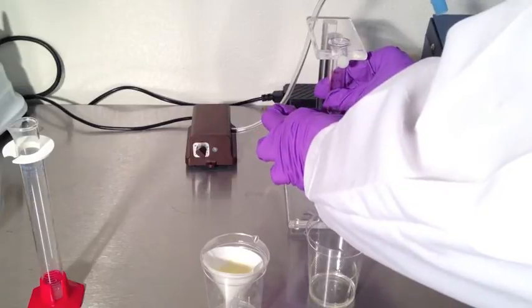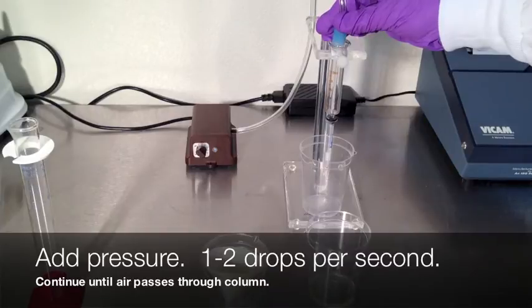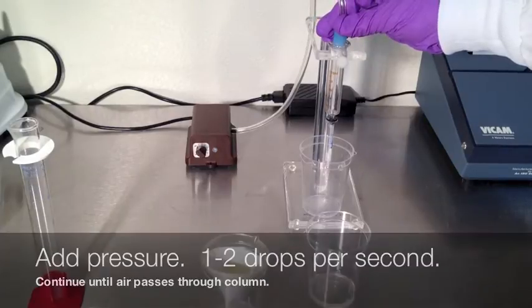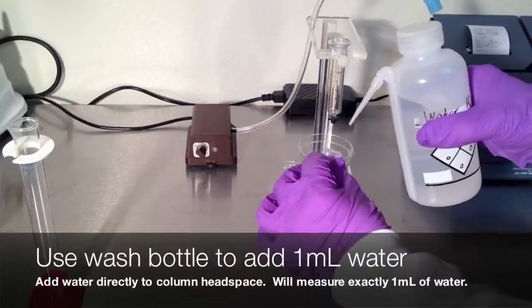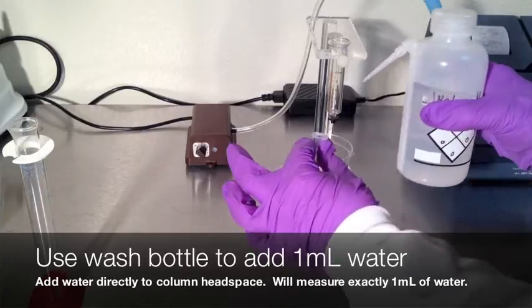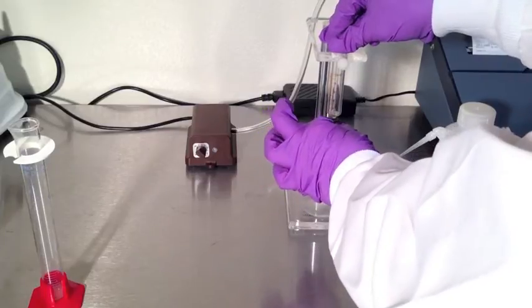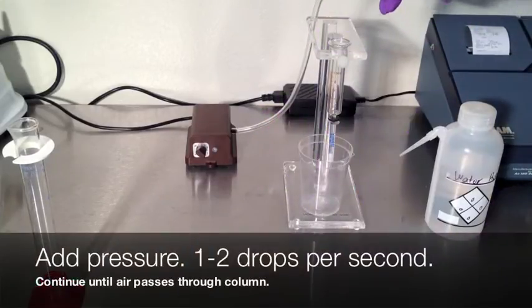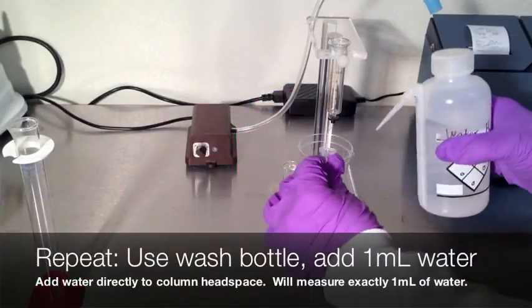Attach the column to the pump stand. Apply pressure carefully and pass one to two drops per second through the column. Once air has passed through the column, remove from the pump stand. Using the water wash bottle, fill the head space of the column completely with water — this will add exactly one milliliter to the column. Apply pressure and pass one to two drops per second until air passes through the column.